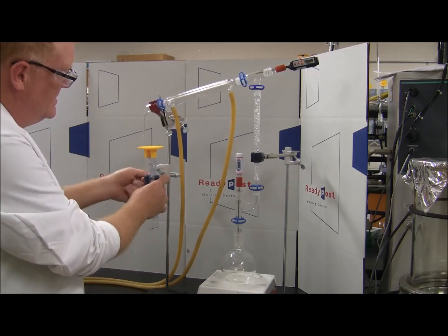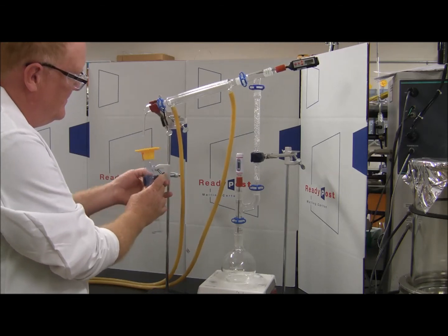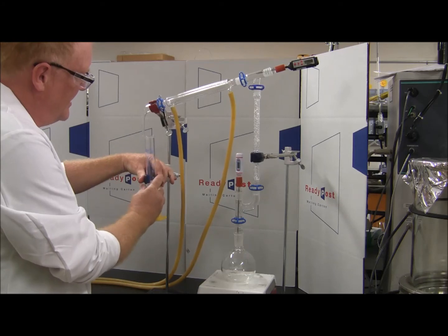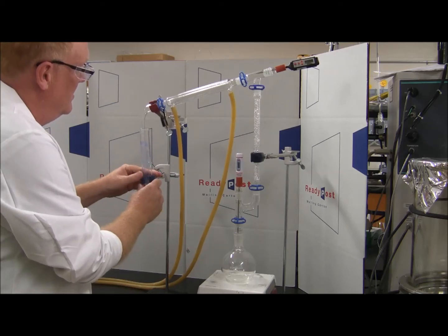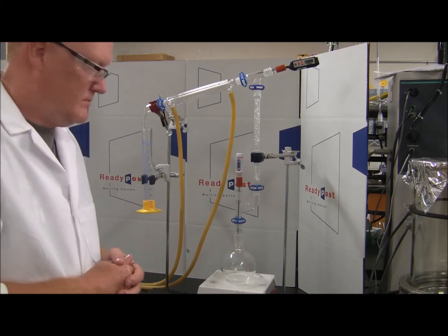Once you've collected your 2 samples, go ahead and use this same graduated cylinder or a different one. You're going to continue to collect the rest of the ethanol through the end of the experiment.